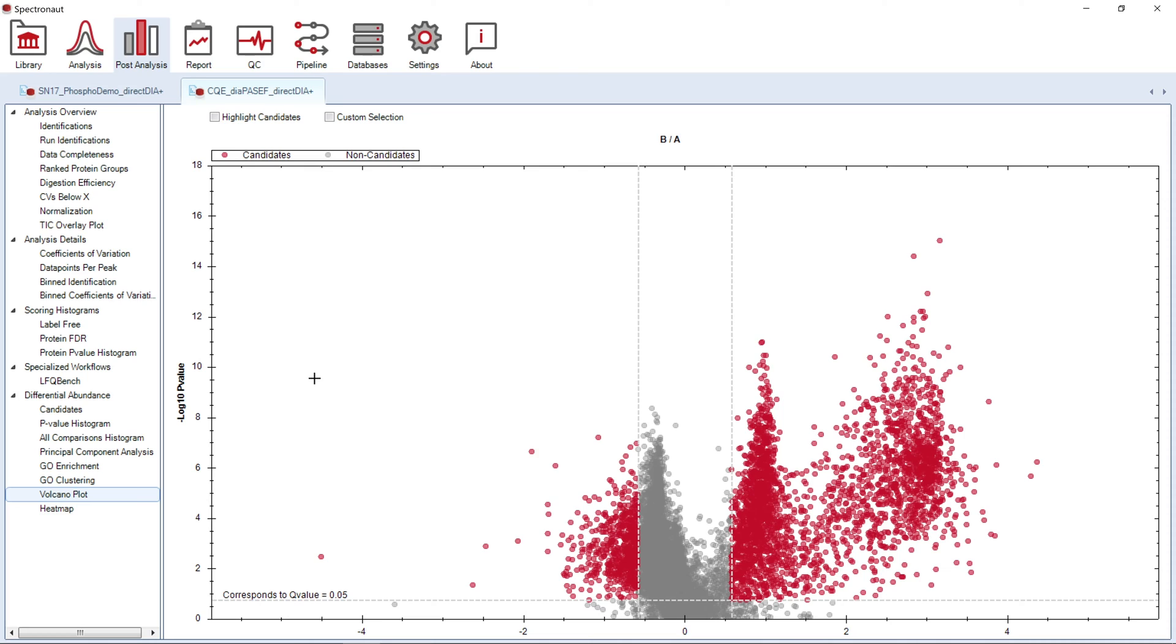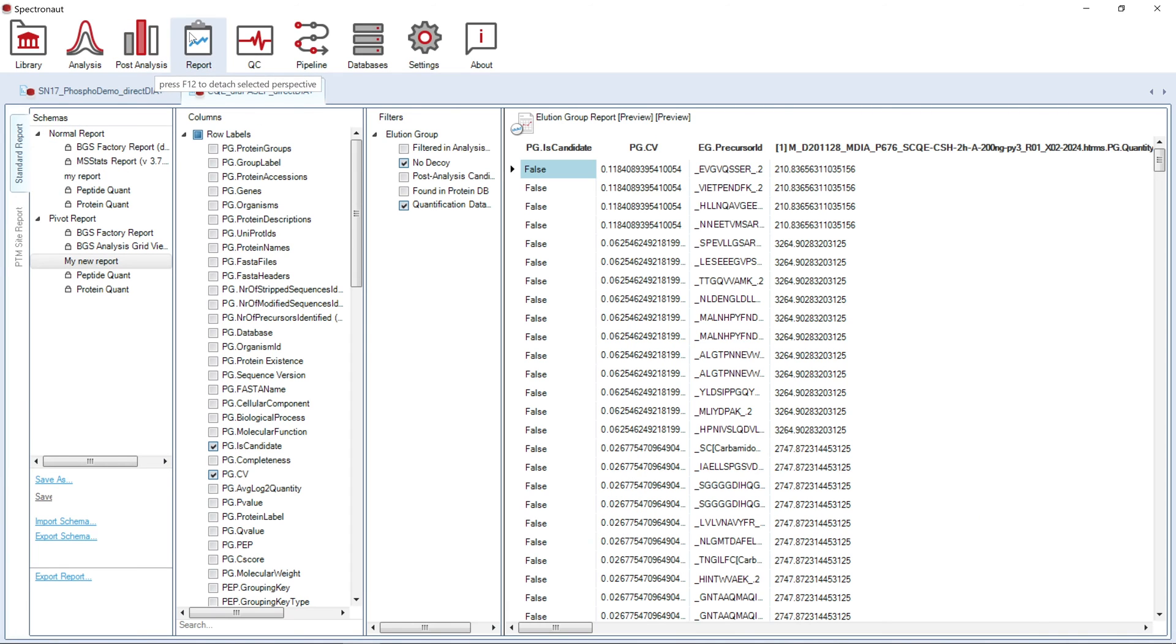If you would like to export detailed information on the qualitative and quantitative results of your analysis, you should use Report Perspective with one of the predefined report schemas or your own customized one.